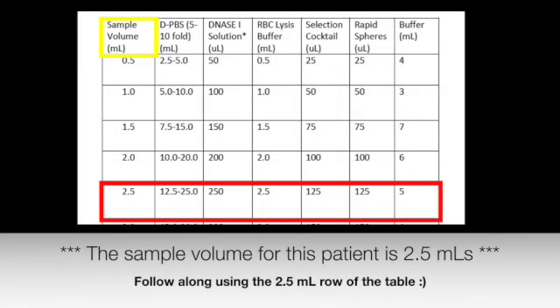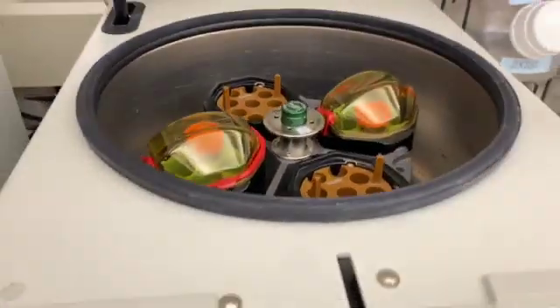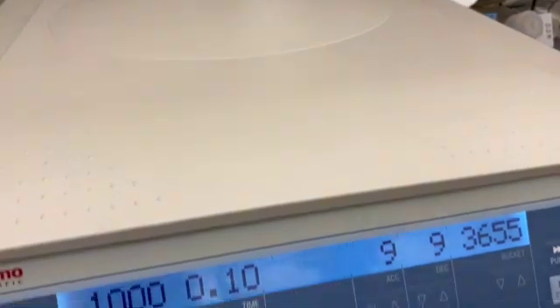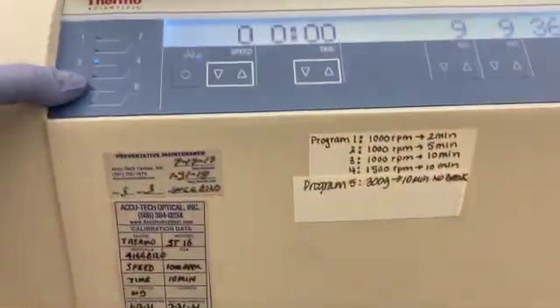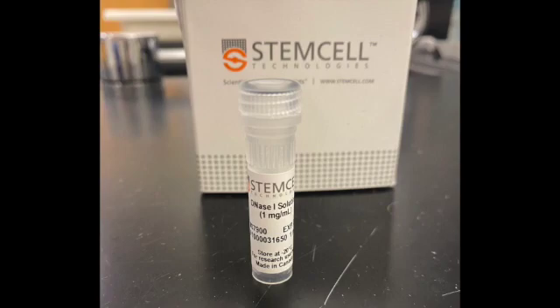Make sure to jot down the sample volume on your setup sheet, rounding to the nearest half mil. Centrifuge the sample at 300g for 10 minutes without the brake on. This is program 5 for the centrifuge on the FISH bench. Because the brake is off, this step will take roughly 30 minutes. During this time, you can thaw the DNase I solution to room temperature if your sample is over 24 hours old.